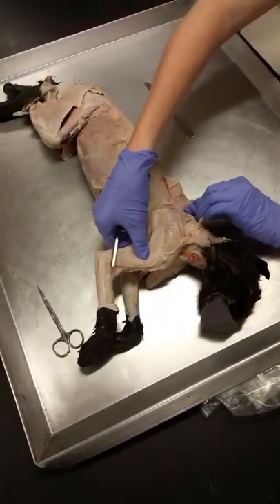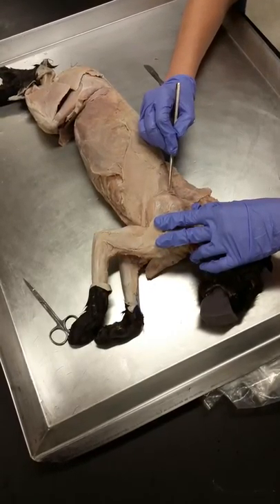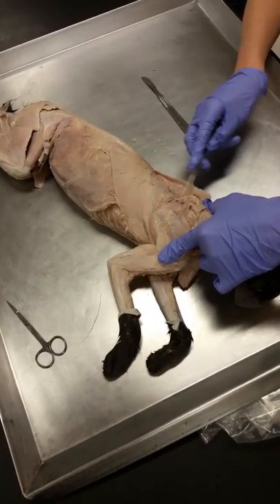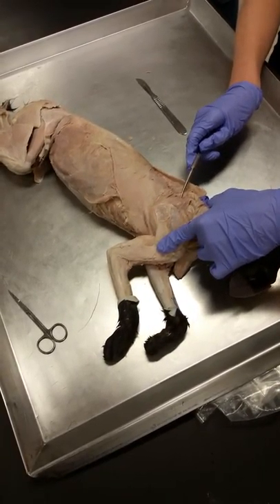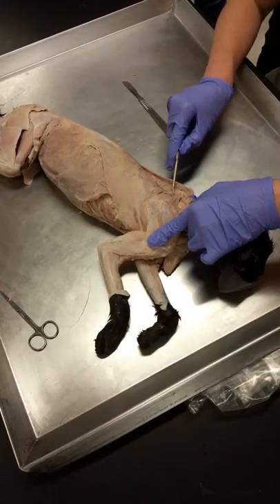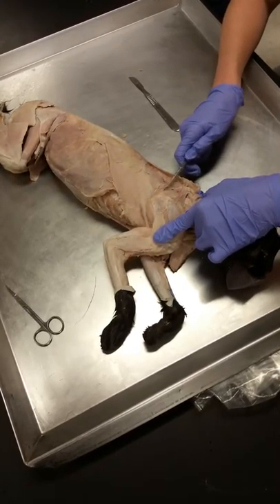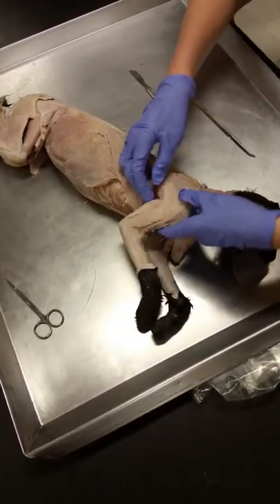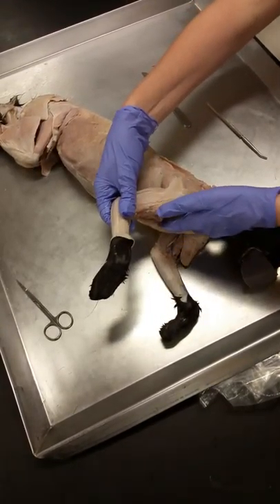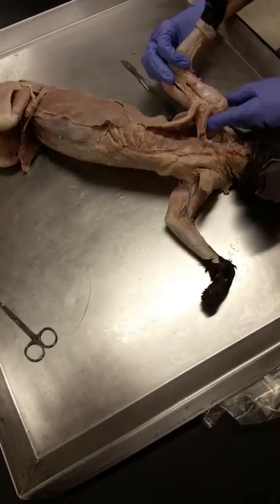If we pull the scapula away from the midline, we've got a group of muscles in here — these are the rhomboids. There is a rhomboideus major and a rhomboideus minor, but you can't tell the difference in cats, and none of us can really tell the difference in the human either. So we're just going to learn rhomboids. Then the fossa underneath the scapula is the subscapular fossa, and the muscle is subscapularis — there's a muscle right underneath there.